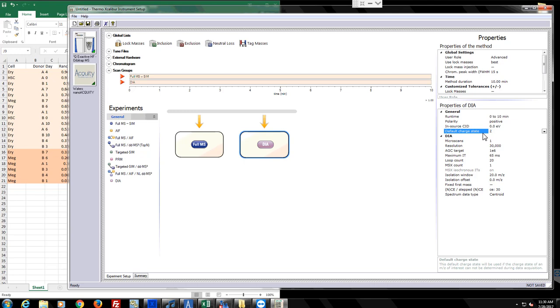So the collision energy isn't necessarily going to be optimal for every peptide that's isolated in that window, right? You've told it to isolate everything in this window at roughly the mass-to-charge at the center of the window, but assume everything in there is doubly charged. So some things might be underfragmented, some things might be overfragmented. I don't see a way around that really. For DIA, you're always co-isolating multiple peptides. With DDA, you know what the precursor is when you isolate it, and you've determined the charge state, so you can optimize the fragmentation. Similarly, with SRM or PRM, you know the charge state ahead of time. We don't have that advantage with DIA, so unfortunately we can't set the collision energy to be optimal for everything.